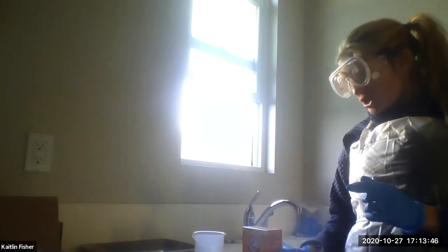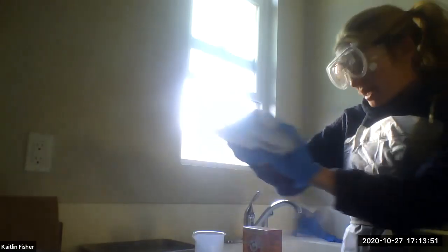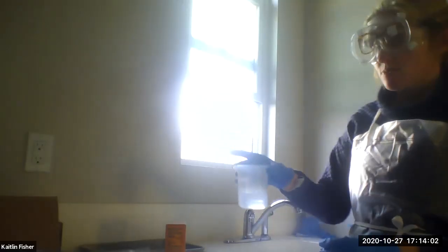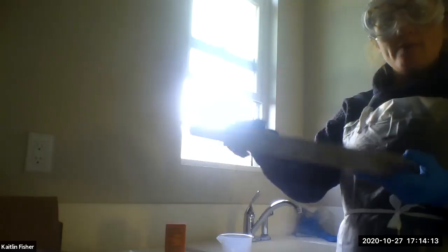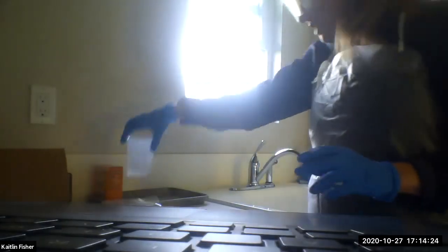So in conclusion, the things I would have in front of you are your qualitative aspirin lab kit, a white piece of paper and a permanent marker, baking soda, and your container of water for your waste disposal. As always, I have my self-contained tray to keep all of my chemicals. We're going to keep all of our chemicals in this tray and have all the equipment outside of the tray. Just to recap, here's what we'll need. I'll lower this camera a little bit so you can see. We'll put our baking soda in this tray, and we'll put our waste beaker in this tray.